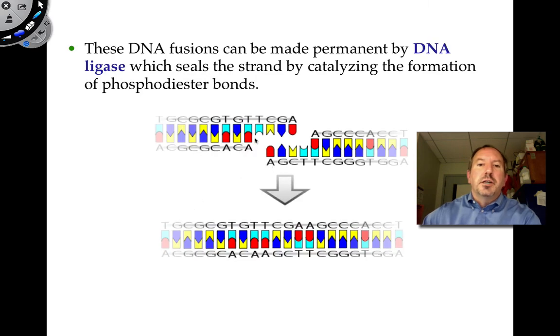As you can see here, the enzyme would cut it, and then you would use another enzyme, and this isn't a detail because we're actually going to be doing this. We're going to be using this enzyme called DNA ligase, which actually seals the piece in. So we're going to put a Redwood gene into a plasmid and then use the enzyme ligase to seal it. And sometimes it's simply called, we're going to ligate it into a plasmid.